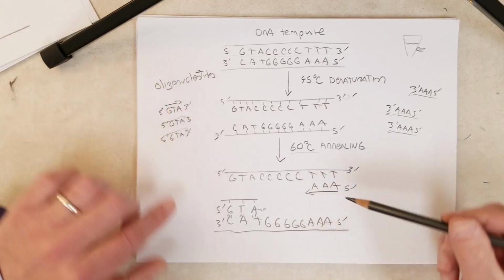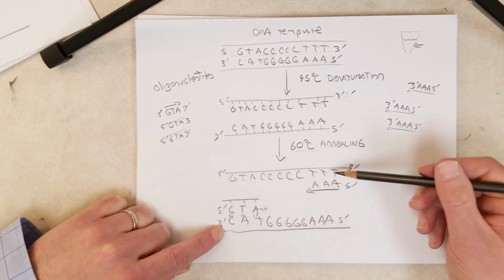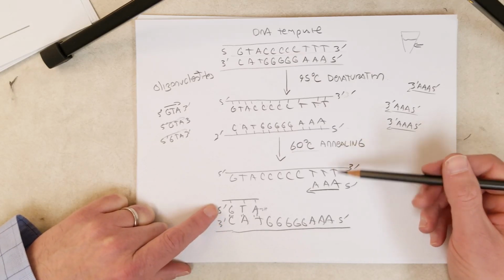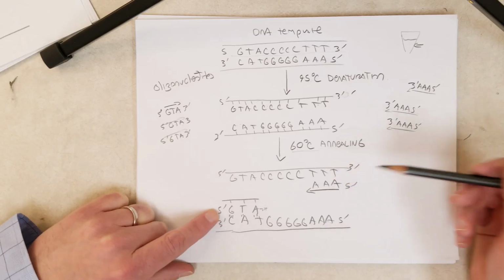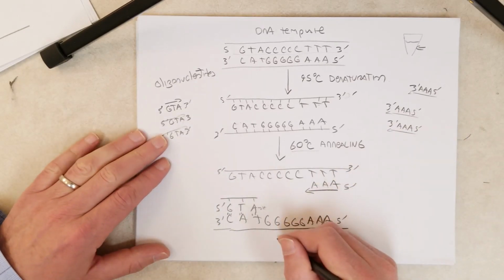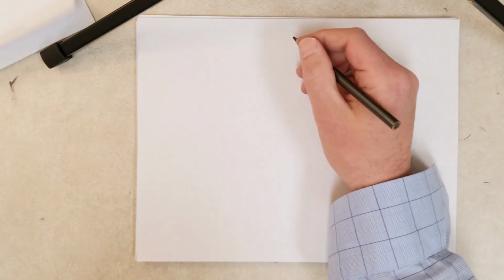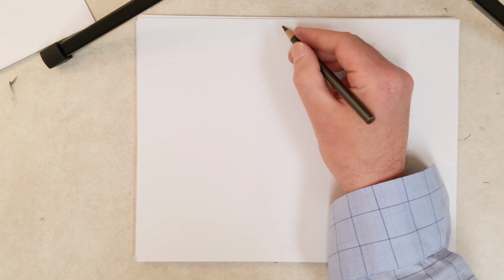Okay, so now we have our primers stuck to the single-stranded templates that we made single-stranded by denaturation. We lower the temperature, and now the primers can stick. Okay, so the next step is the extension step.